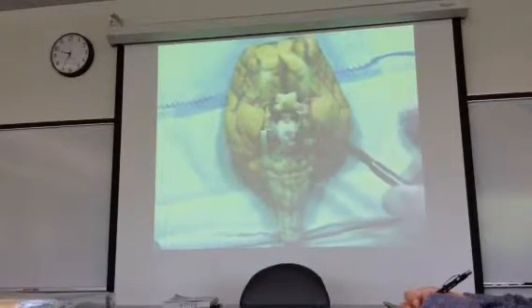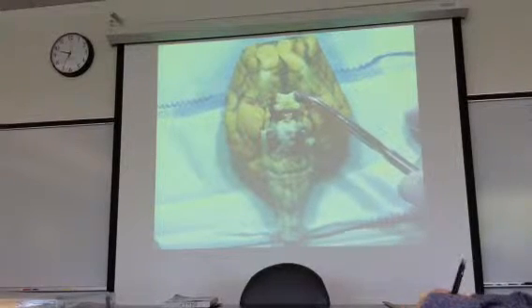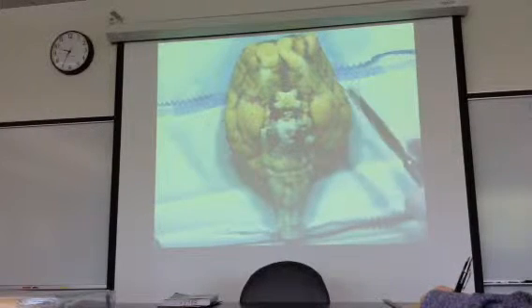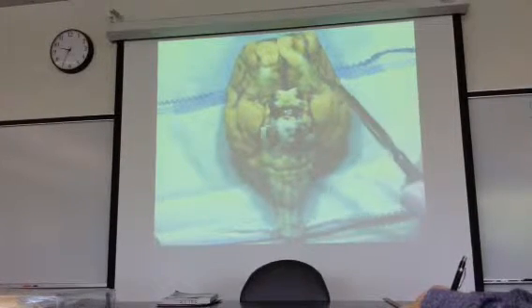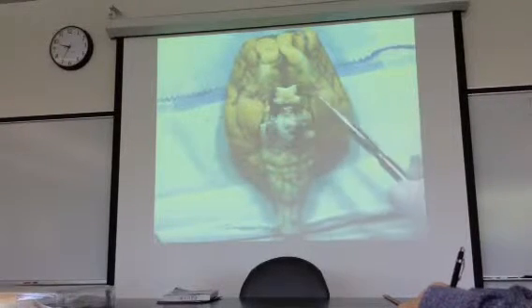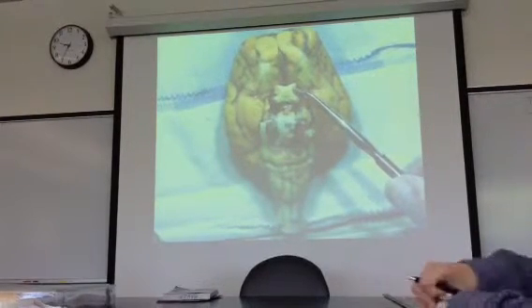Do you guys see this X right here? The cut edge was cut kind of short, but it actually goes all the way out to the eyes, which are sort of laterally located on the sheep. Those are optic nerves. Optic nerve 2, the cut edges of this X. Optic nerve 2.